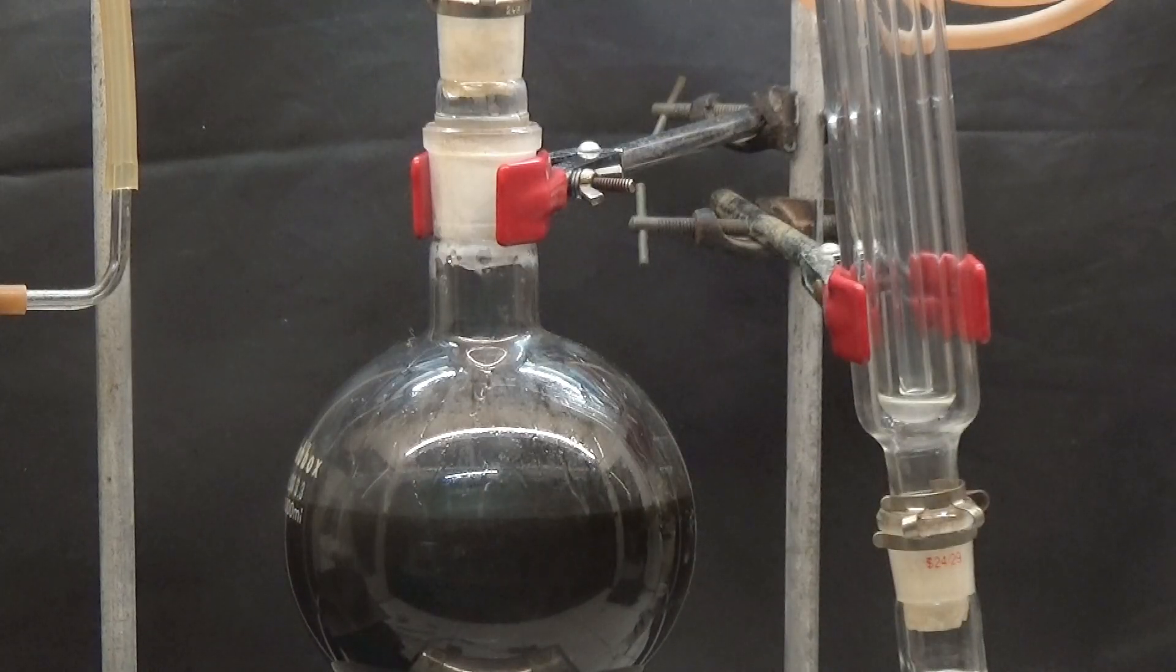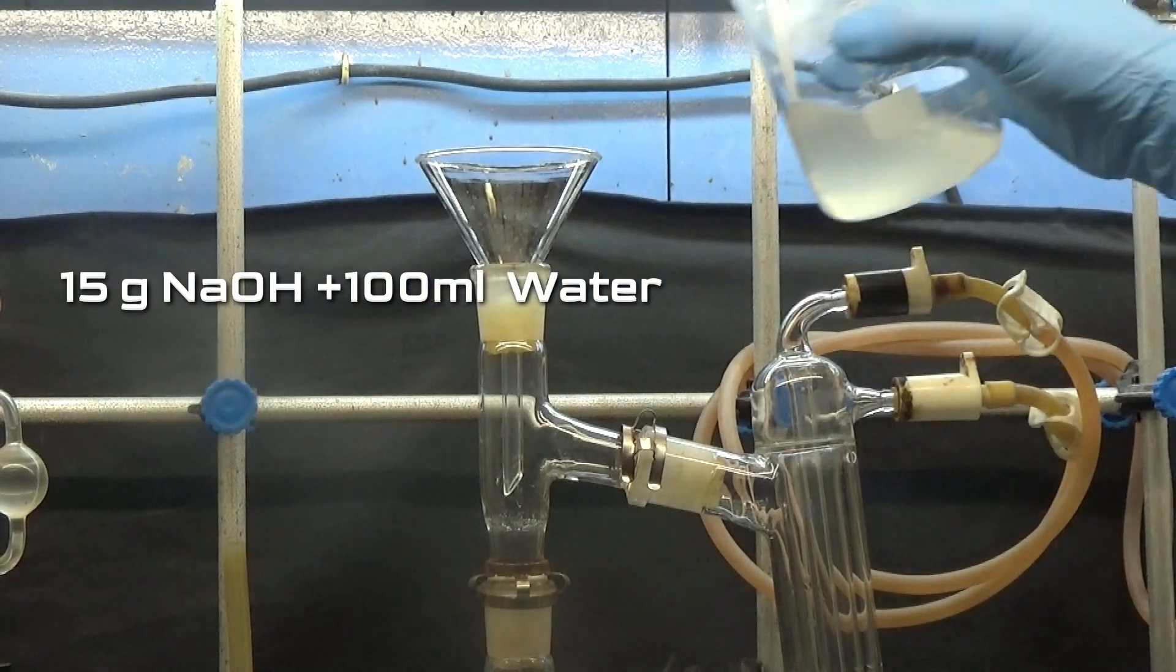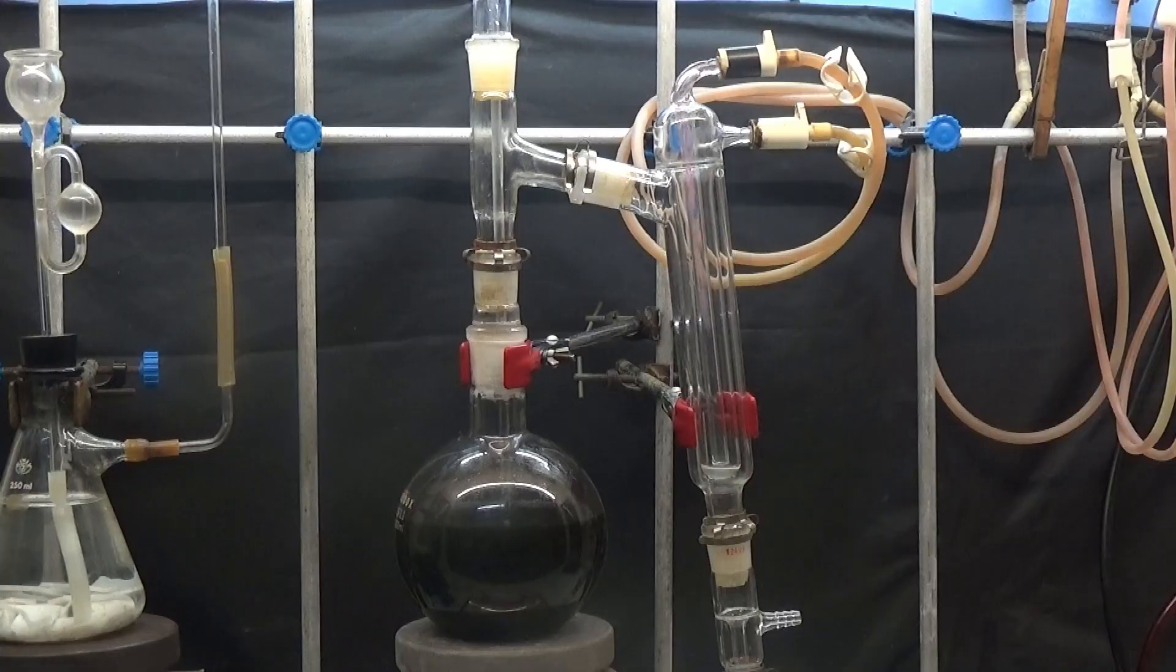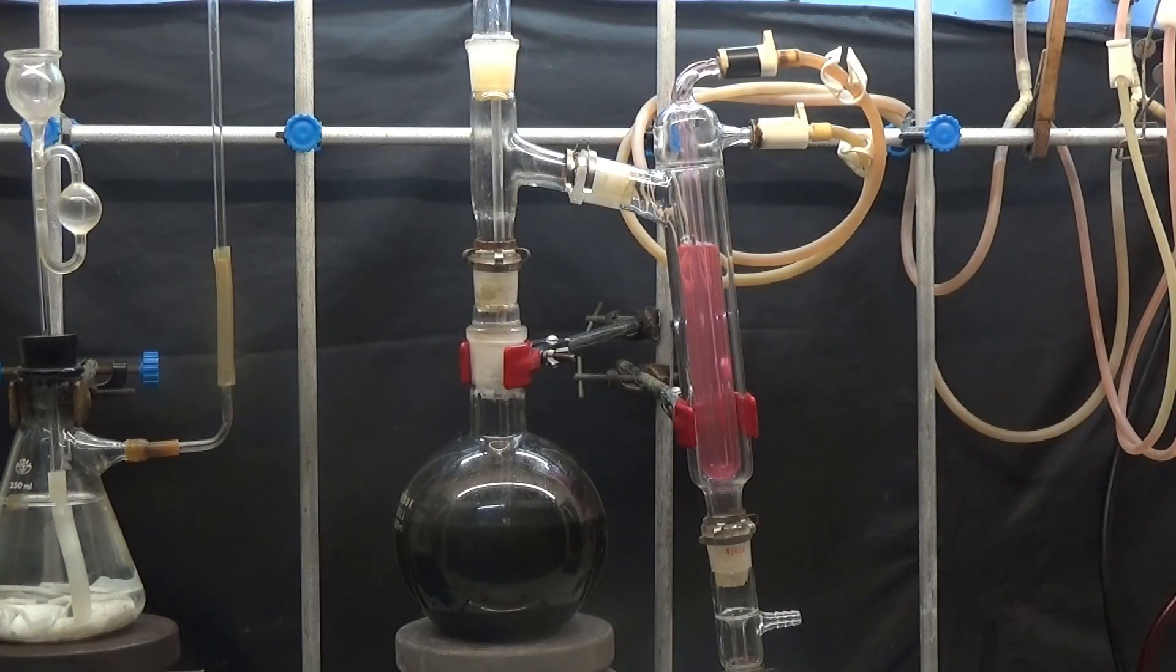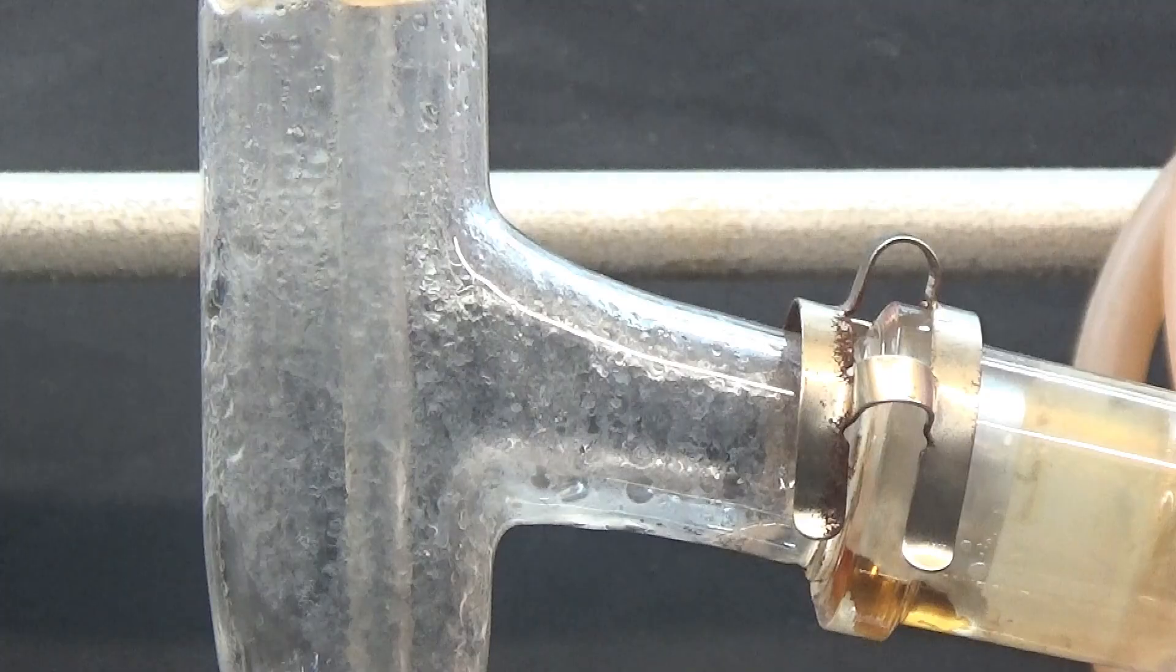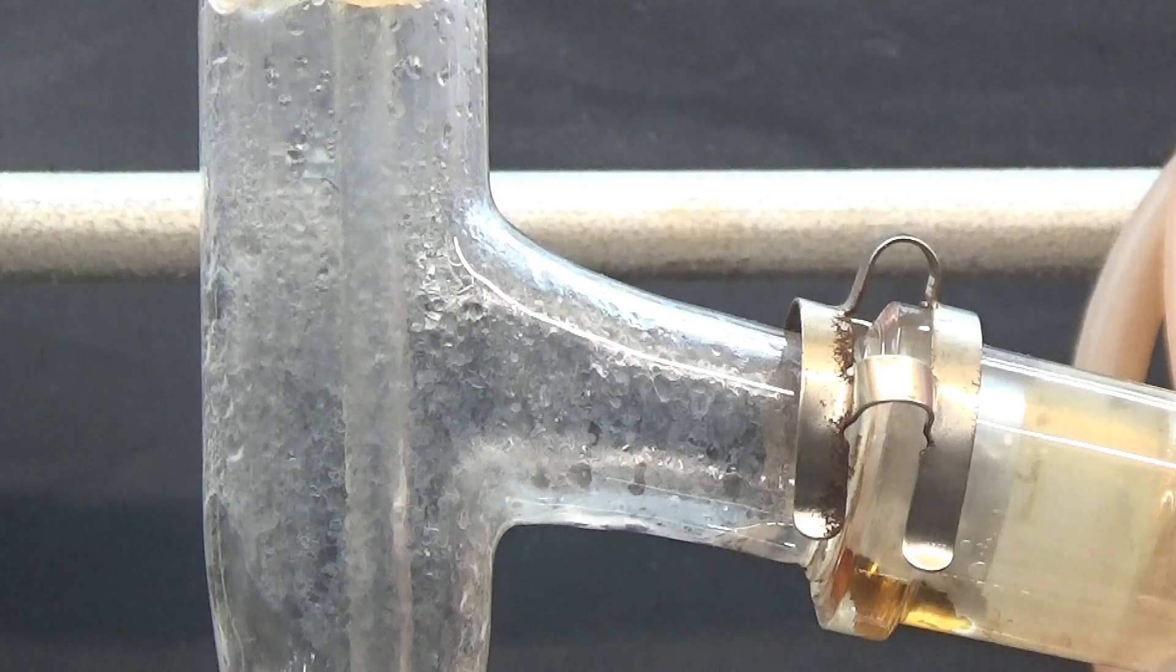The filtrate is put in a 1000 milliliters flask and a solution of 15 grams of sodium hydroxide diluted in 100 milliliters of water is added. Set up a simple distillation apparatus and slowly distill most of the methanol. Once it is observed that white colored oil distills, the distillation is stopped.